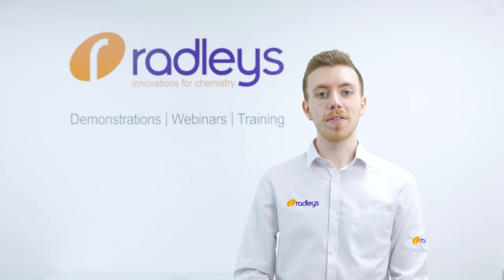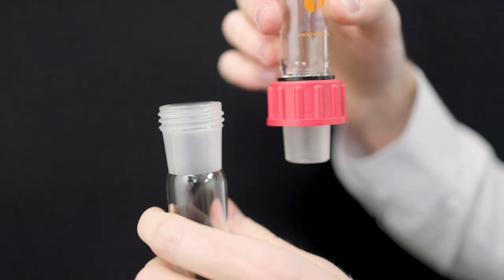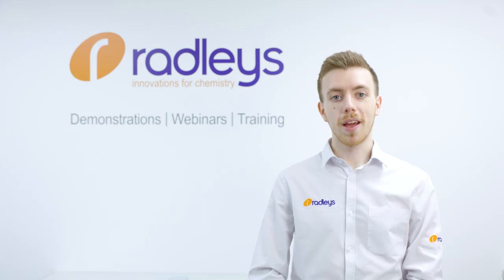And because the glass thread and Rodevis cap sit outside of the standard glass joint, the ground glass joint is still compatible with generic glass joints of the same size. Threaded glass joints make a vacuum tight, greaseless seal. Therefore the connections remain absolutely stable and can be easily separated again.